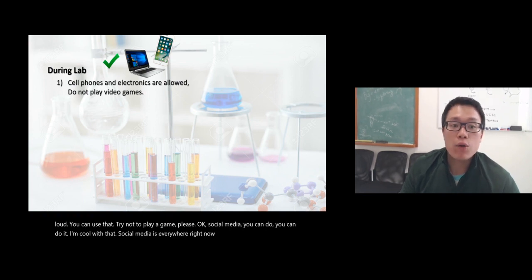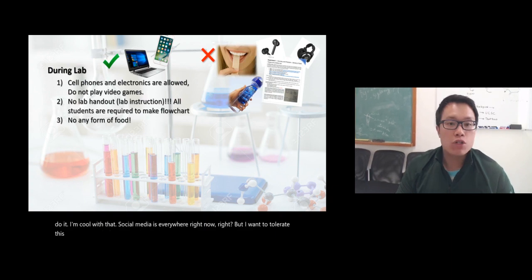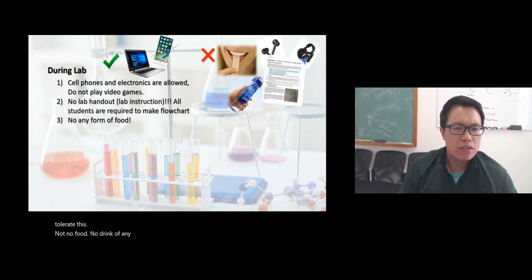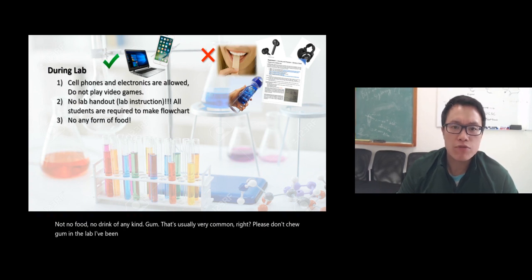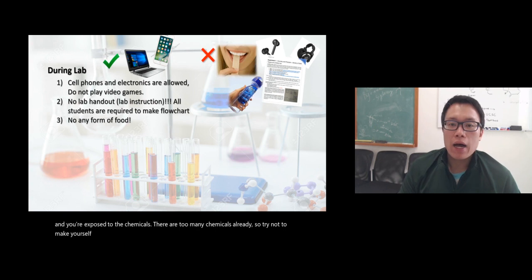But I won't tolerate this: no food, no drink of any kind. Gum is very common, right? Please don't chew gum in the lab. We try to avoid any type of food and drink and contamination, since you're exposed to the chemicals. There are too many chemicals already, so try not to make yourself vulnerable to this.